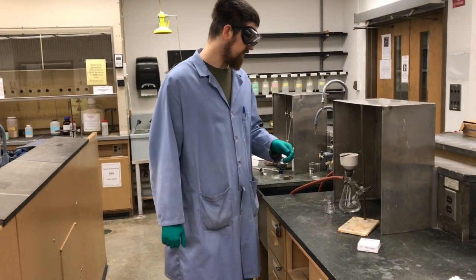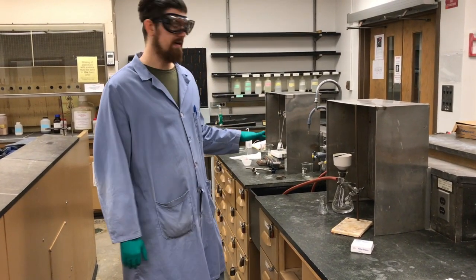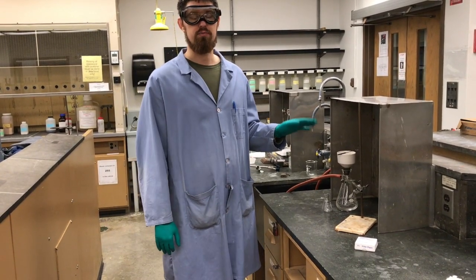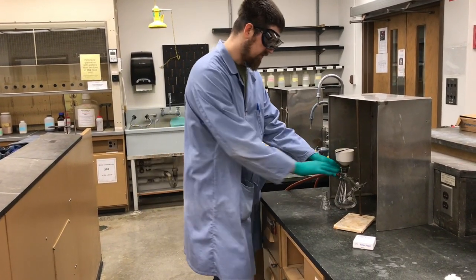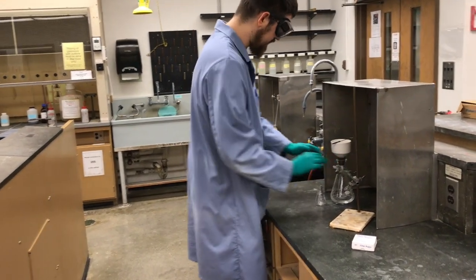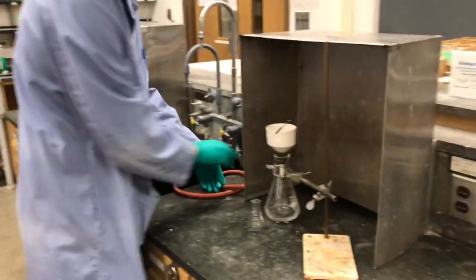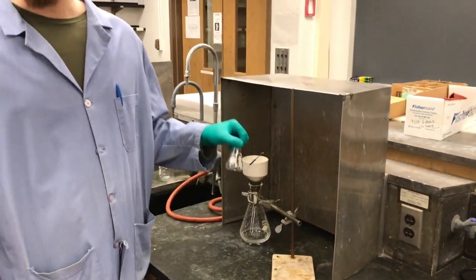Okay. So our ethanol and our water have heated up, and it's been about 5-10 minutes. So our crude product should now be dry. So I'm just going to transfer it into a small Erlenmeyer so we can do our recrystallization.